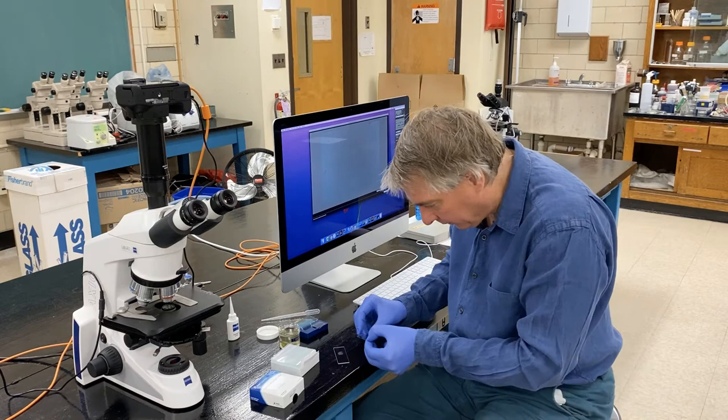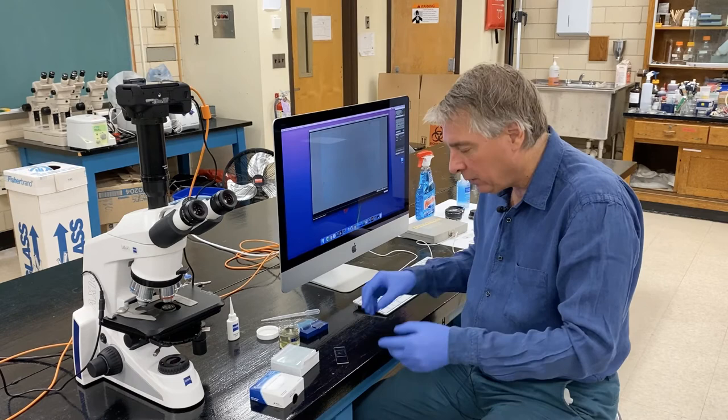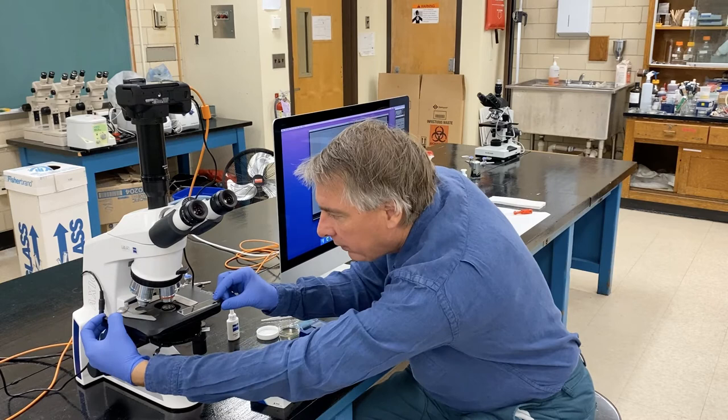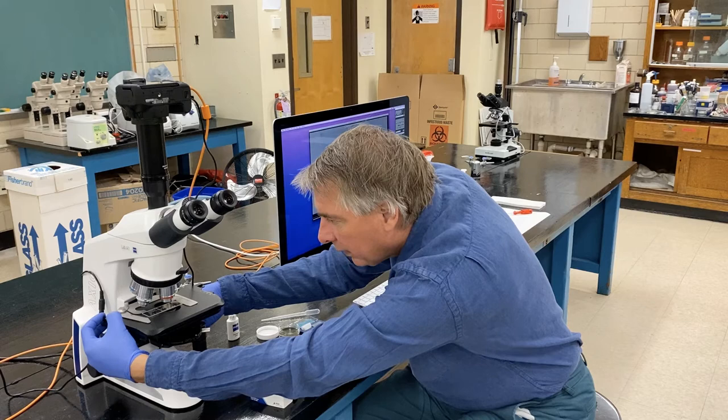And then, like I said, I put one edge of the cover slip on the glass slide, and then I just drop the cover slip onto the sample. And that helps to alleviate bubbles, although it's pretty tough to avoid all of them. And then I'm going to put this on the microscope stage in the slide holder by moving the spring lever out and then sliding the slide into place and then releasing the lever. And this is our sample.